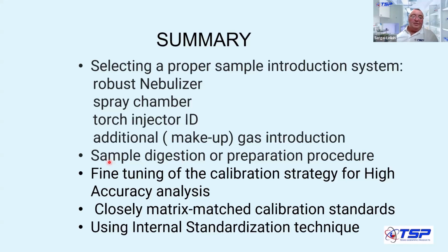One thing that I did not mention, and it's worth mentioning in the end, is of course using internal standardization. It's almost a must in all of these applications that I mentioned.